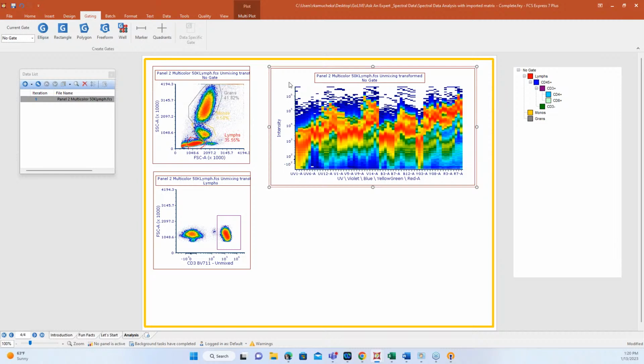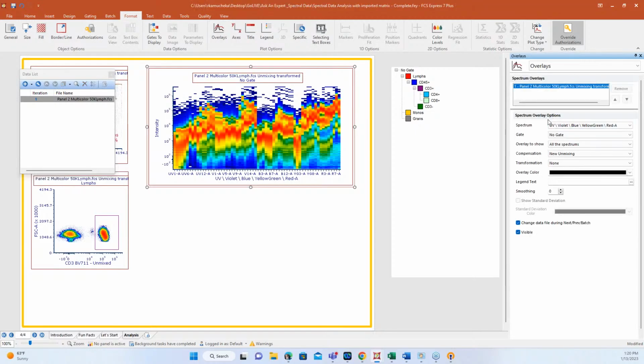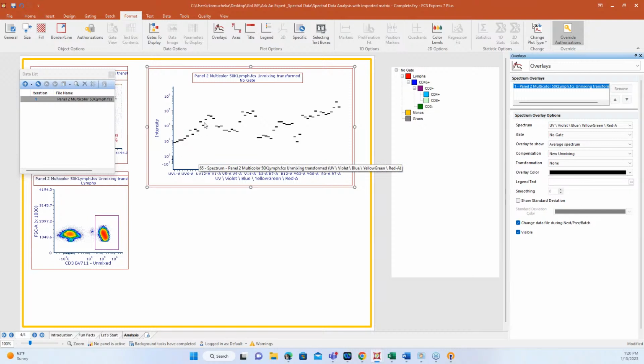One of the things that we can also do with any of our spectral plots is we can average out our signal here. What I mean by that is with any kind of instrument where we're working with lights, we kind of get this spread and spill, right? So you can see in the middle here that at this red point, this is like any density plot, this is where most of your cells are falling. So FCS Express does a really good job in the formatting part: you can change this from all spectrums to an average spectrum. It takes that same pathway of where those peak density places are, and plots them out for you.